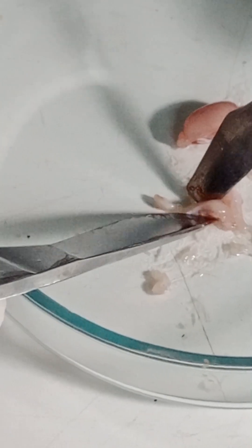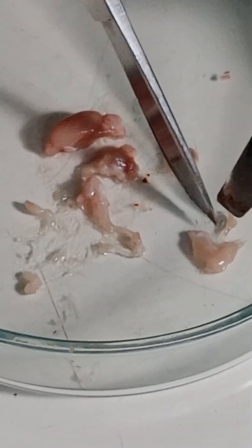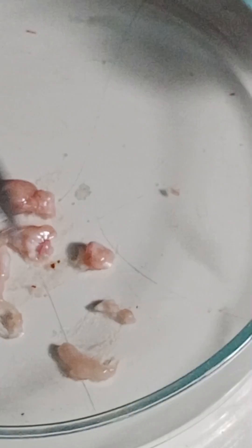I am separating the hippocampus for biochemical analysis. It is a very small part of the mouse brain. I hope this video will help you. If you are watching this video for your own benefit in science, it will help you. Thank you.